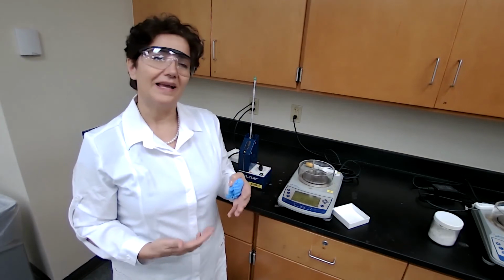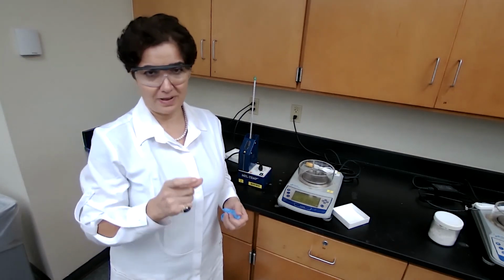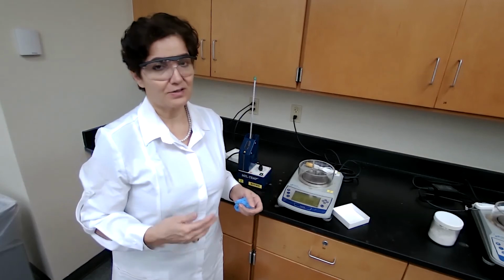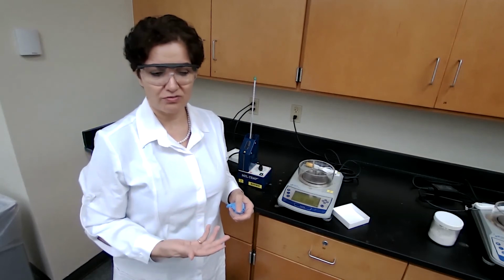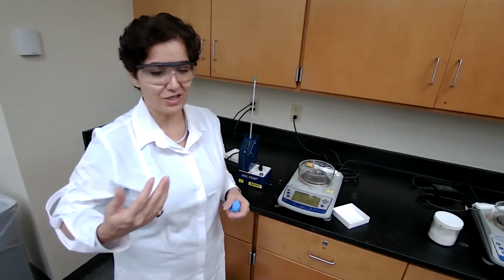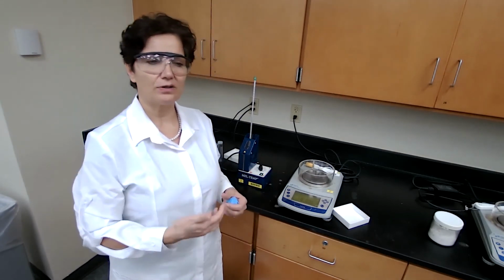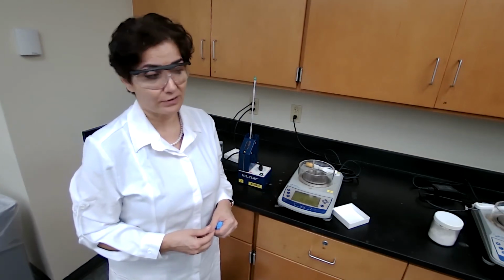The melting point can tell you if the sample is pure or how pure the sample is, for which you are going to use the melting range of the sample. Anything higher than 2 degrees is considered a wide range of melting. 2 to 3 degrees is going to be a wide range of melting, and a wide range of melting indicates that the sample is not completely pure. You can write about it and explain what you think happened, that the sample is not completely pure, maybe it's not completely dry, or other factors.